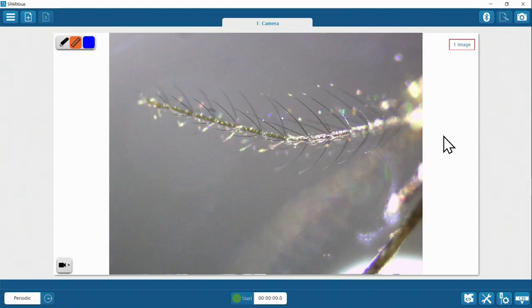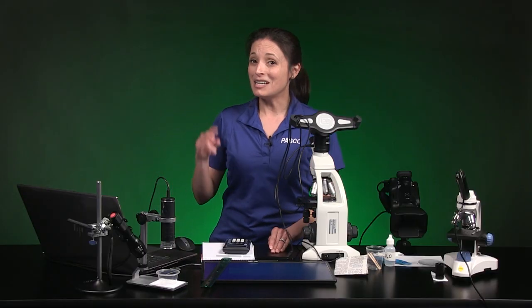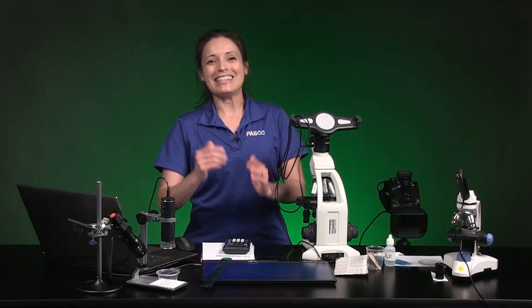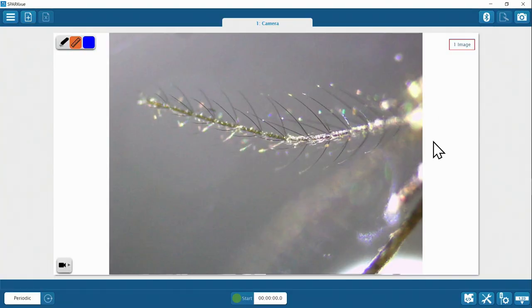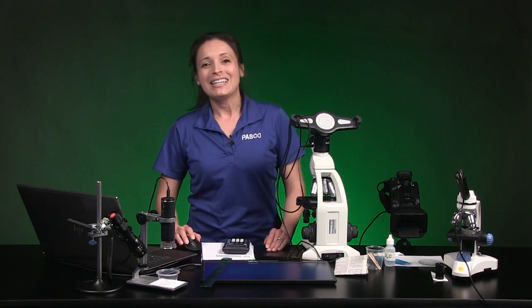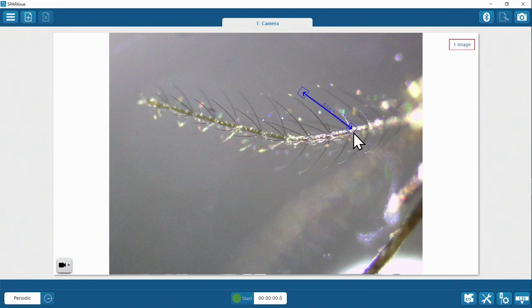I'll give you four seconds to look at a magnified image and guess what it is. Here's the image. If you guessed a mosquito antenna, you're right. But what if I asked you to compare the average length of an antenna hair found close to the head with the length of a hair found far from the head? Technically that's not hair because its chitin-based chemical structure is different than the keratin-based stuff found on mammals. According to SparkView, this hair is about 0.7 millimeters long.